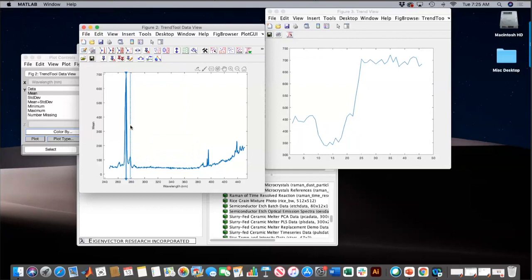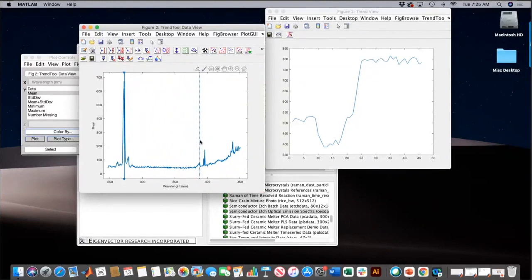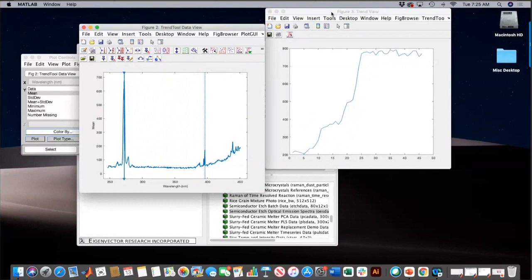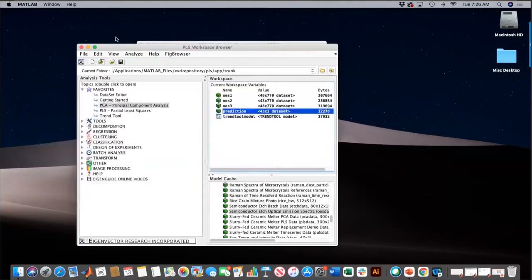This is one way to reference it though, to that. And of course, you know, you can put that then anywhere, and reference it to, for instance, that peak right there. Okay. So I wanted to show how to get into this from another way. So we looked some at baselining, and I'm going to close this.